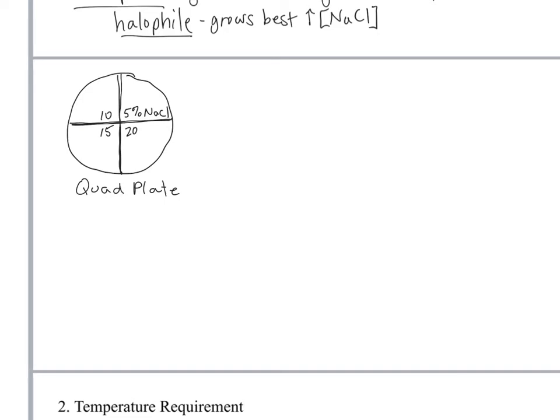But what you're going to do, you're going to take your assigned organism, whatever that organism is, whether it's Bacillus subtilis or Staph aureus or whatever you've been assigned to. You should have some either broth or solid plate cultures there. And you're going to, with your loop, get some organism and then streak your assigned organism on the quadrant like this.